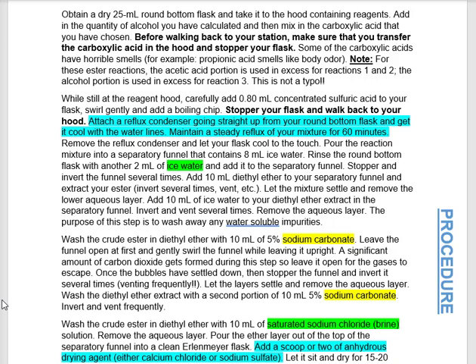All right. After you've allowed this reaction to happen, there's a couple of things that start happening. You're going to take that reaction mixture and put it in a separatory funnel, and then you're going to rinse the round bottom flask and the separatory funnel with ice water, and then you're going to use that same ice water with the separatory funnel. Okay. Now, in essence, you're going to wash the product with ice water.